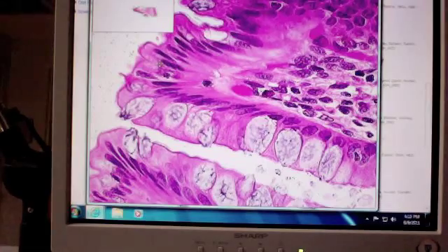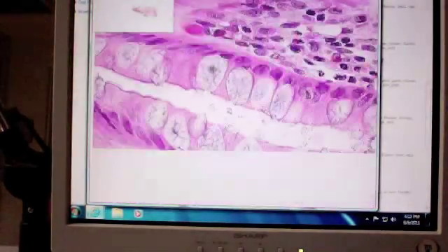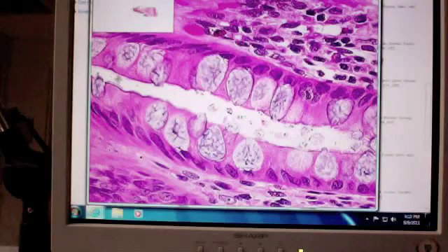Is it all microvilli? No, now inside the tubular gland itself, again you can see we've got these little terminal bars. All right, so that's going to cue you that these are still microvilli along here. But what you can see is that you've only got microvilli on the columnar cells. Your goblet cells do not have microvilli on the top of them. Okay.